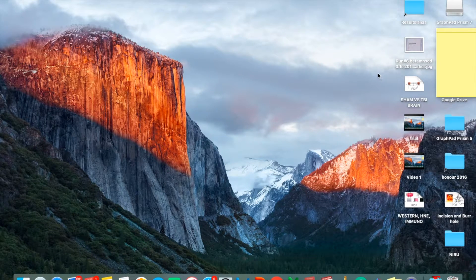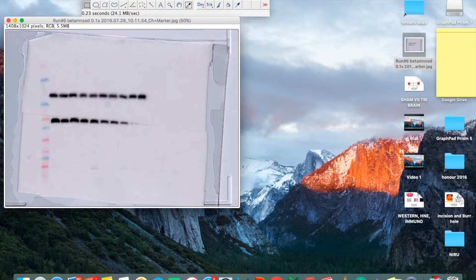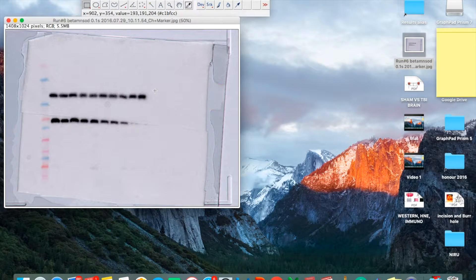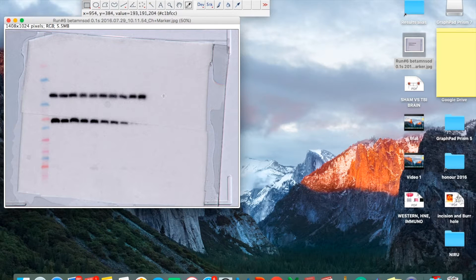The first thing is whichever image you want to analyze, drag it into ImageJ software. Now there are a couple of methods that have been extensively used by many scientists. I'll use both of them. The first way is to select individual lanes — it's quite lengthy. The second way is to select the whole lane area and analyze in one go, though it's not quite as rigorous. Still, the ratio of the results is quite similar.